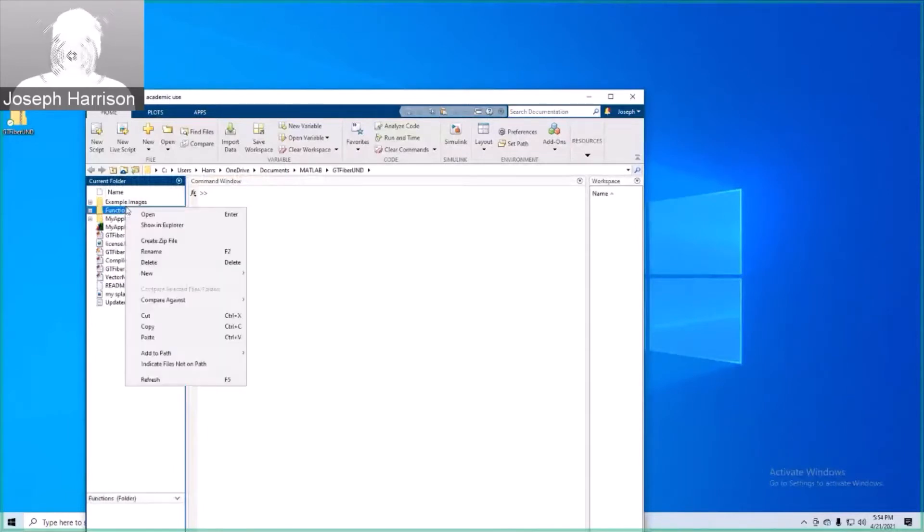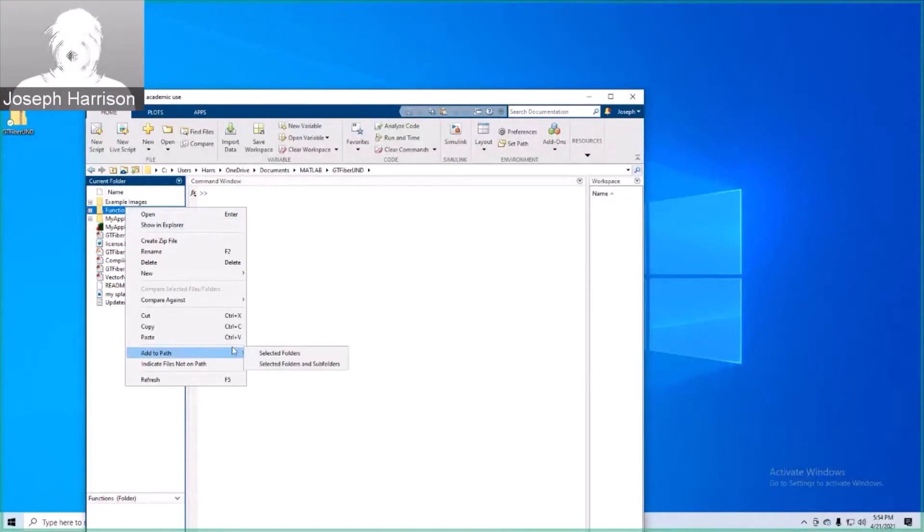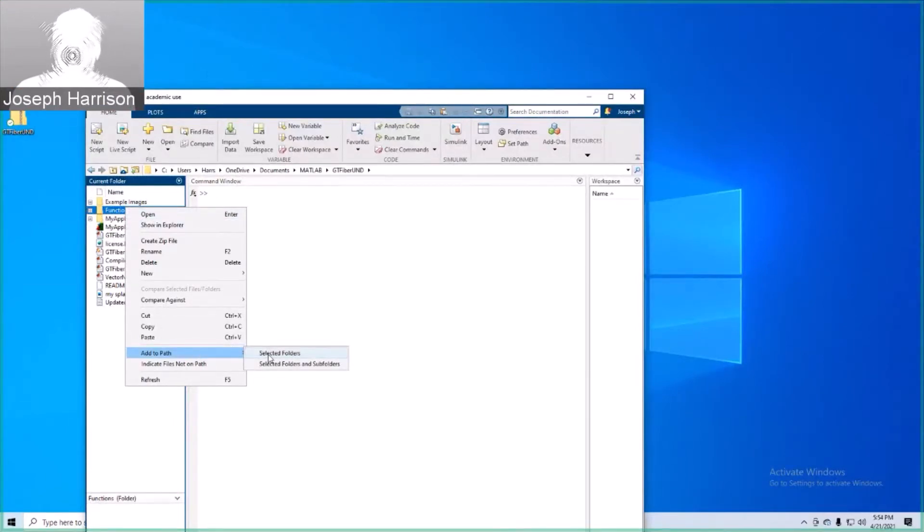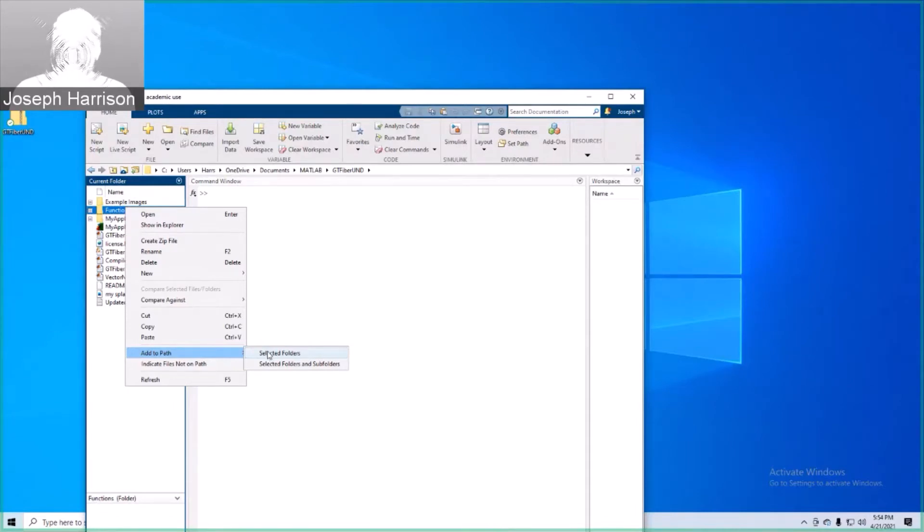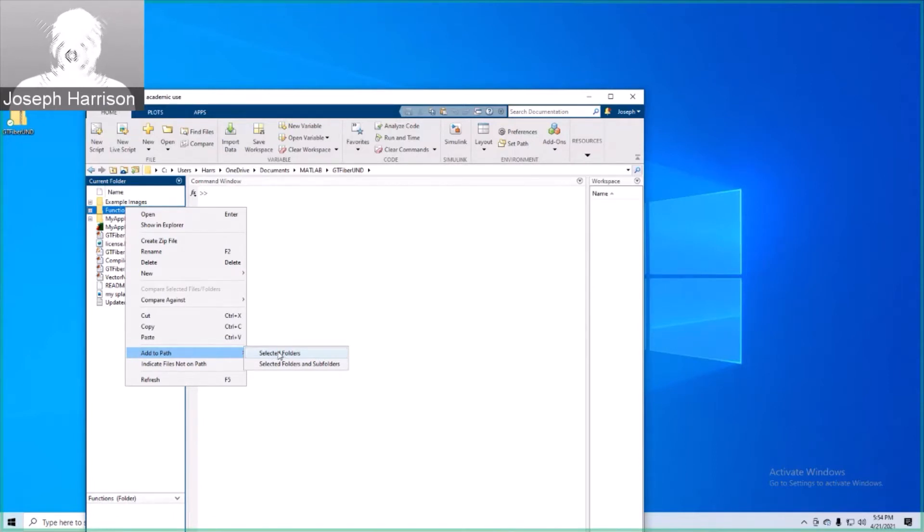One thing that's very important, you need to go ahead and add to path. Sometimes this doesn't happen automatically. If you ever get an error message upon trying to launch GT-Fiber by typing GT-Fiber into the command window, it's usually just because it's not added to the pathway. So make sure every folder here is added to the path, particularly this functions folder.